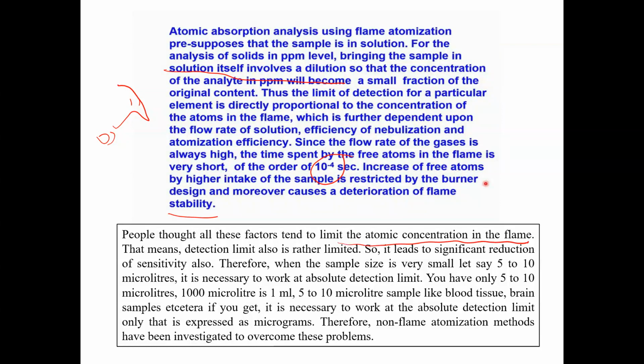So all these factors tend to limit the atomic concentration in the flame, right? Basically, there are some limitations that limit the atomic concentration in the flame. That's why the detection limit is also compromised, or it may reduce the sensitivity also.